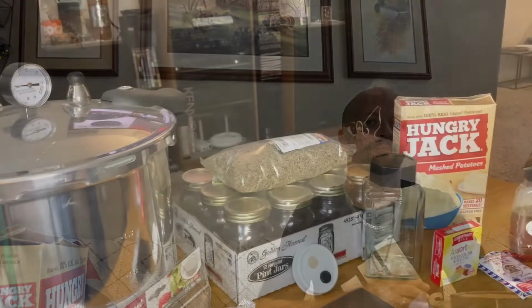This right here is just going to be about some supplies that you'll want to gather in order to be successful with your mushroom growing, as far as making agar, your own ryeberry jars, and what to use to sterilize those things. So I will be going over those right now, and here we go. Alright, so here we go.